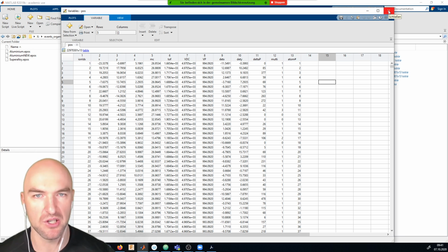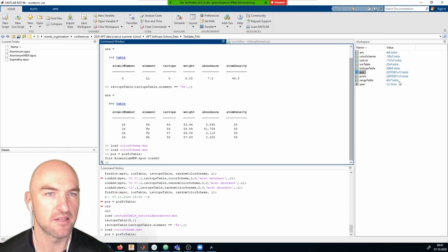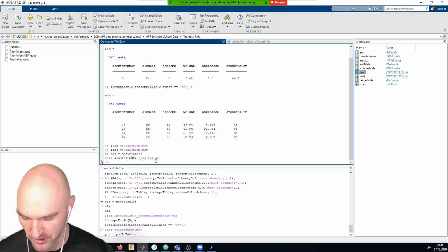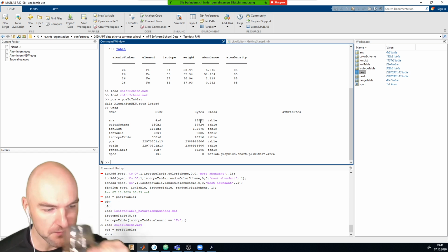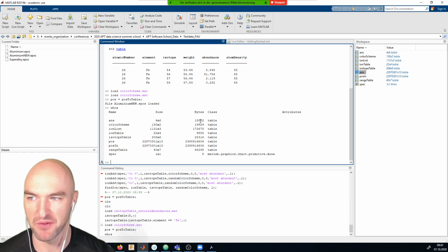And with that, we can actually already do some nice and neat things. So for example, this is a relatively long data set, so I think that's what 22 million atoms. But one thing you can also do is look up how large the files are in terms of size, and what you will see is that Matlab is very, very, very memory efficient.